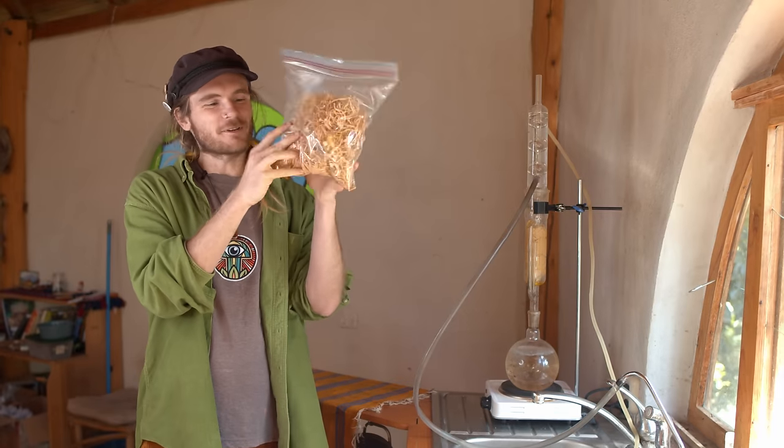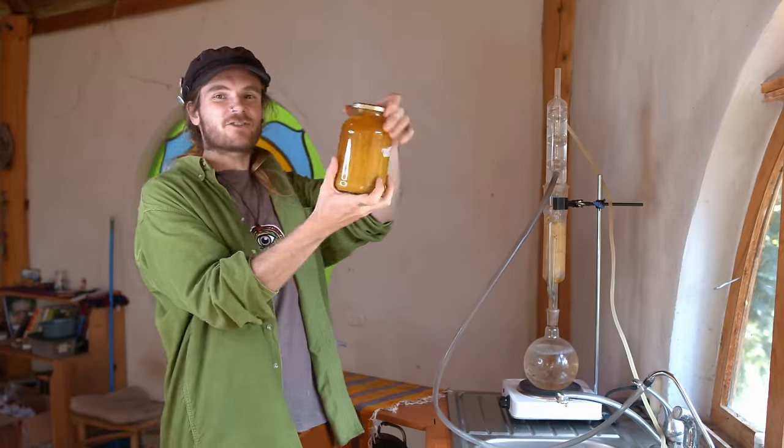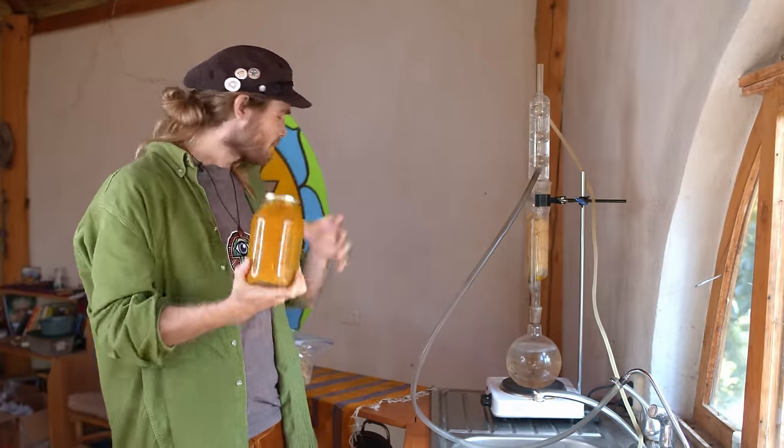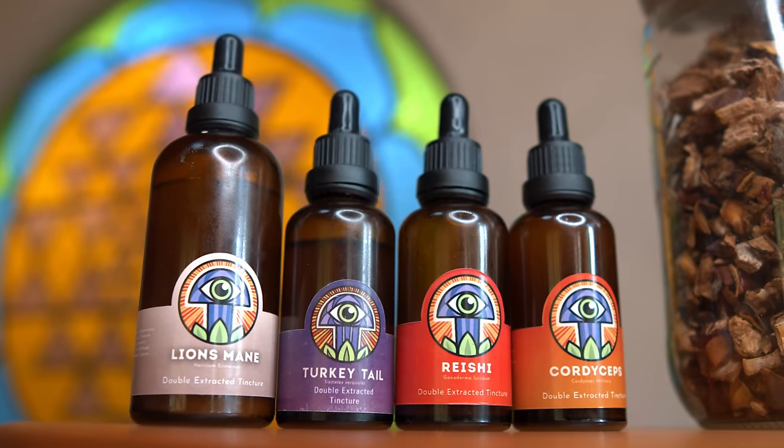In this video we're going to learn how to turn your homegrown mushrooms — like these cordyceps that we've grown — into powerful extracts that you can consume, share with friends and family, or turn into a product like this tincture bottle. So let's get into it.